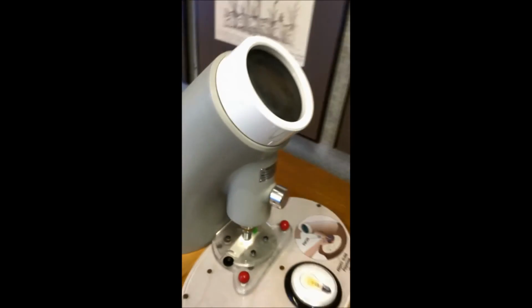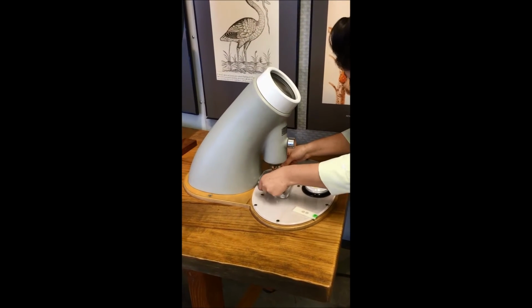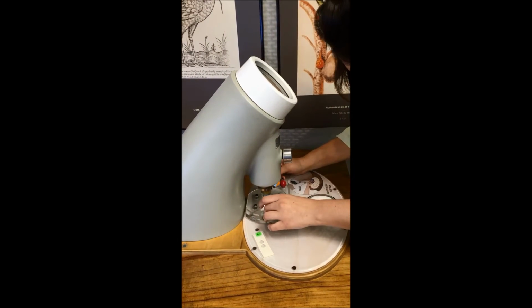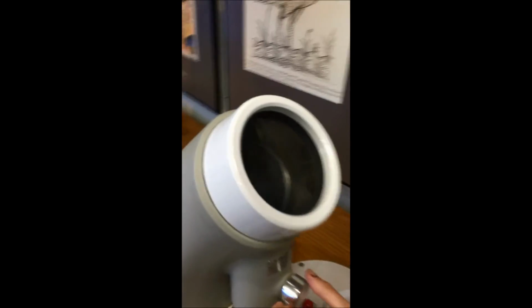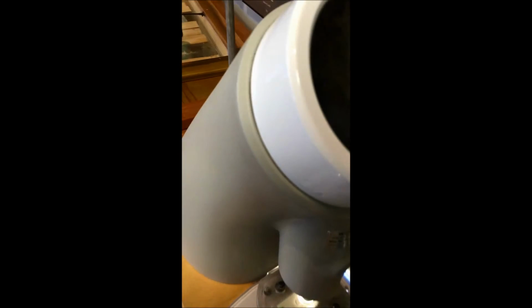It's kind of blurry. Okay. Which I think is because this is stripped. And so we have to move things out. Oh, okay. That makes sense. So now that the slide is in, we can focus in on this to find bacteria. And there are those. Just wait a second.